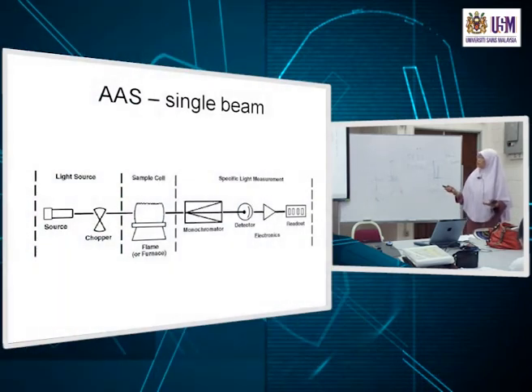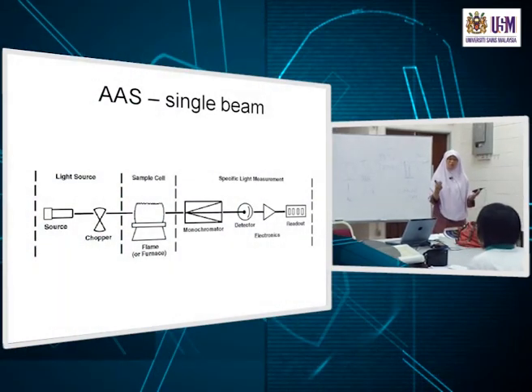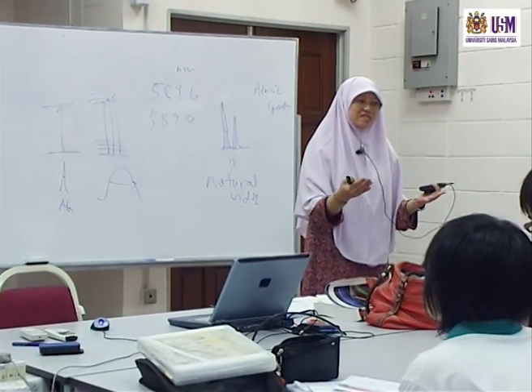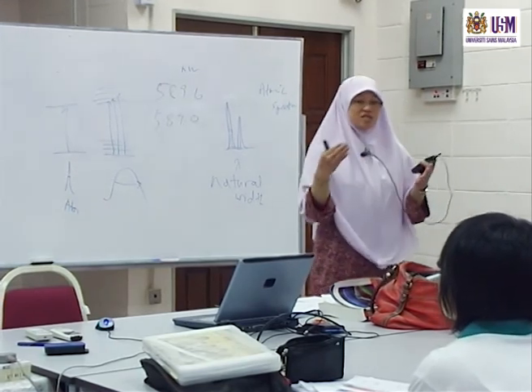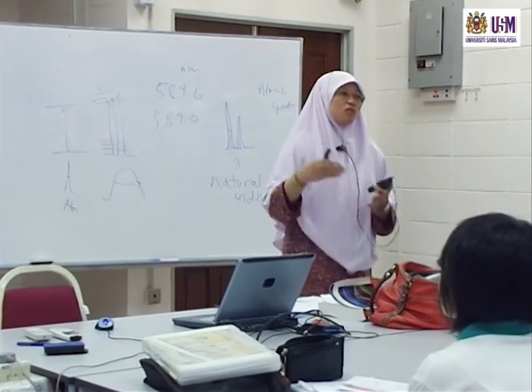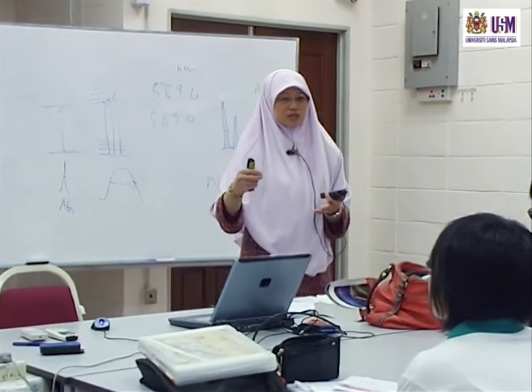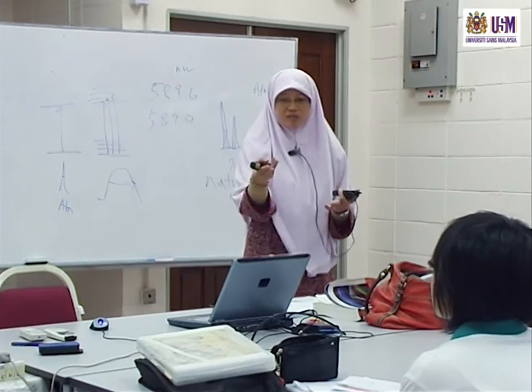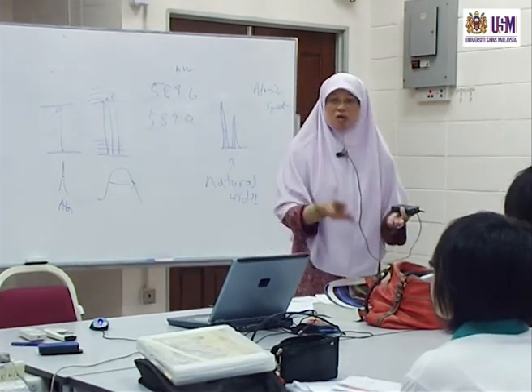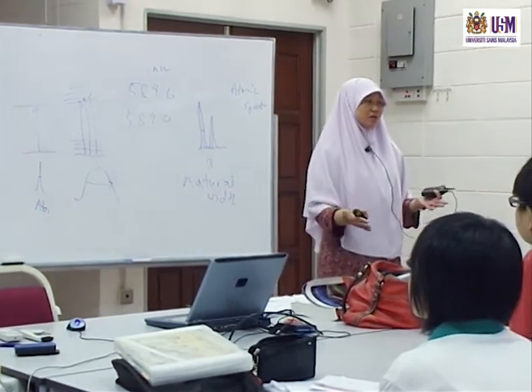Okay, now in doing these techniques, we will look again at: what is the basic principle of that technique? What is the instrumentation used? What are the applications? Because you want to know the calculations involved, you know, what kind of data do you get from such a technique? So all the techniques that we are going to be discussing from now on will be based on that.